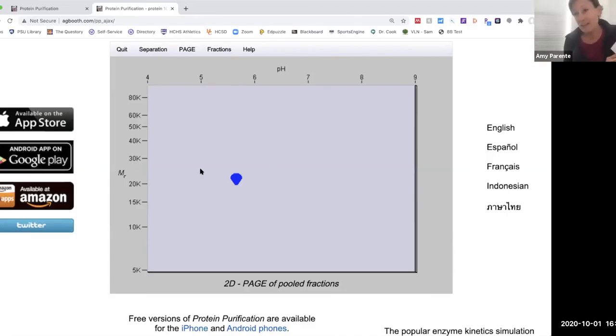If you get really lucky and you go through all of these and then everything worked, you're just going to have to force it to do something that you don't want. So maybe choose a high temperature. Maybe do a pH that's outside of the range you're supposed to. You could probably try to force it to fail, right? But the idea is you need to have 3 separate purification schemes that get you to here.